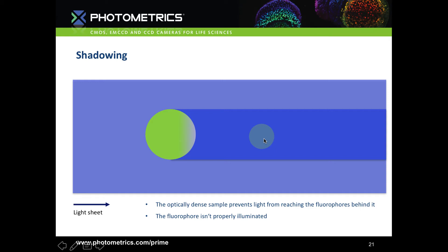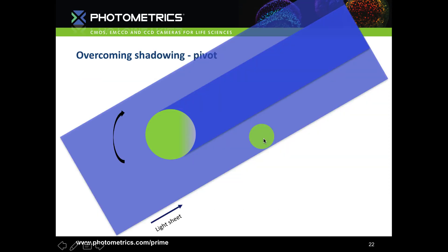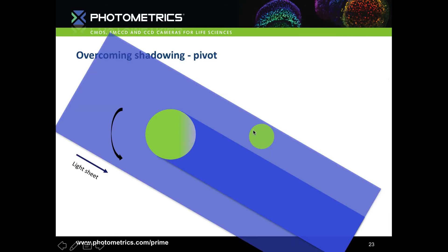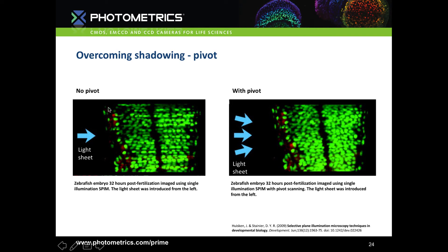Lightsheet microscopy gives us the ability to do something about shadowing with what we call multi-view lightsheet. One method is to use a pivot scanner to rotate the lightsheet up and down to allow illumination to penetrate behind optically dense structures. Using the pivot scanner the lightsheet is pivoted up and then down, so fluorophores behind optically dense structures become illuminated. Going back to the zebrafish embryo image, there's now almost no shadowing present on the pivoted image.